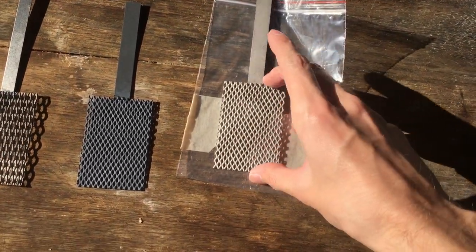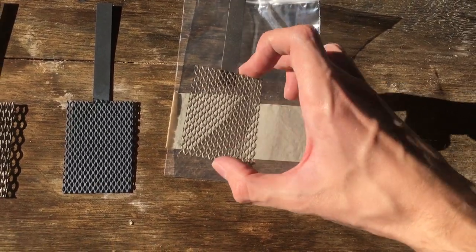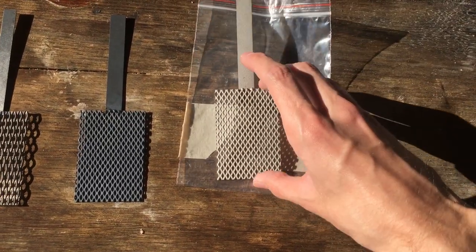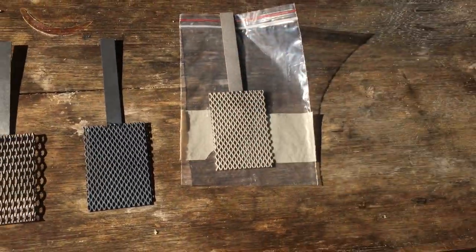Did I mention it's platinum coated onto titanium? That's a very important point. It's not actually pure platinum, as nice as that would be. It is just a titanium mesh plated with a very, very thin layer of platinum to be electrochemically active.